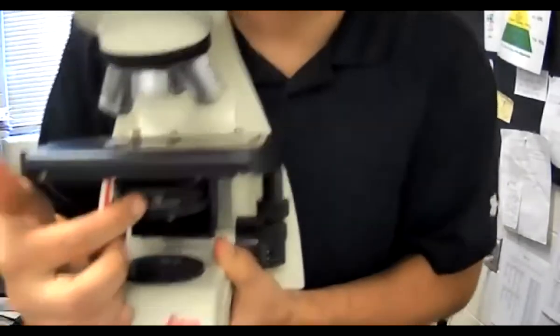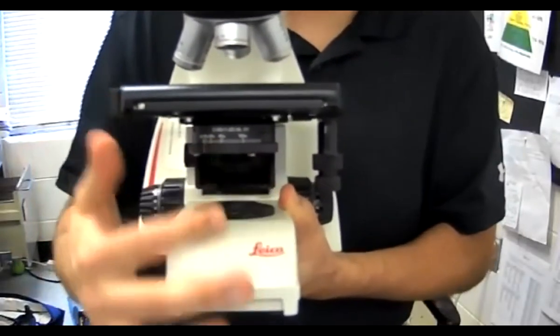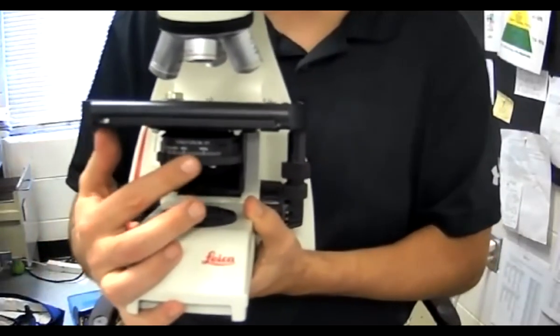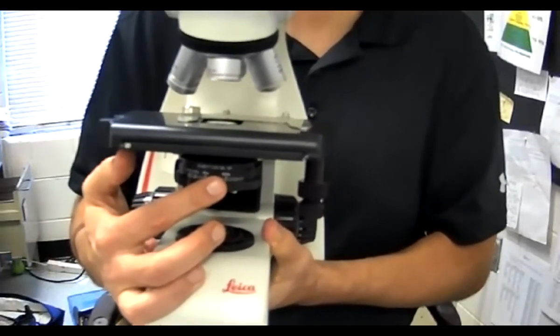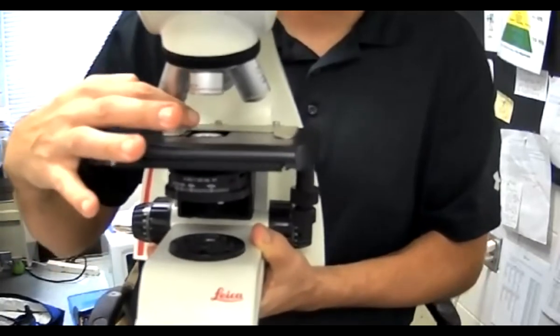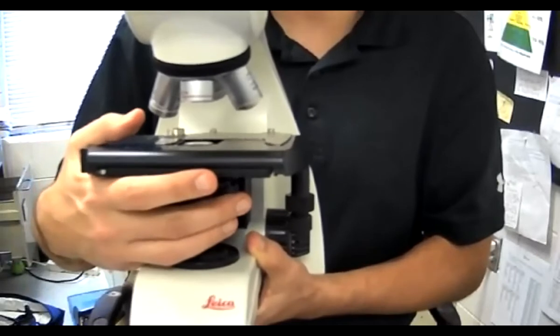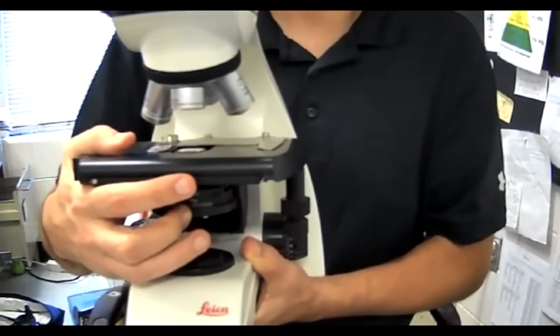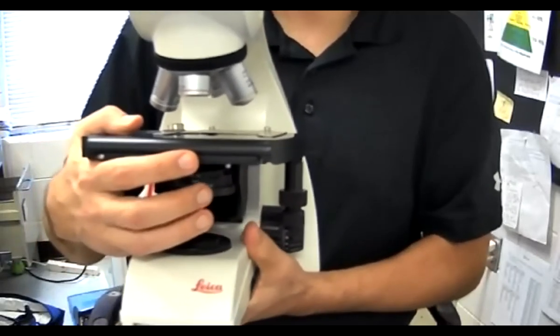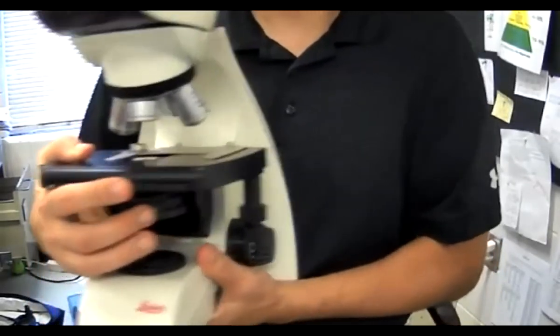This one right here is the diaphragm. It's called the aperture diaphragm ring. Aperture means hole — it controls the hole that's up in here that lets the light through. You can shut the hole or open the hole to control how much light comes in. It's called the aperture diaphragm ring.